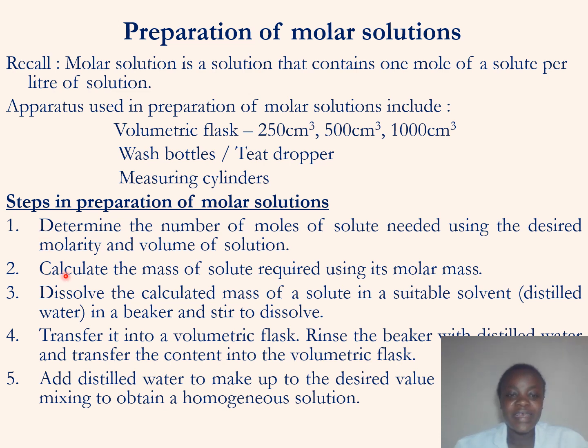The first step is to determine the number of moles of the solute needed using the desired molarity and volume of the solution. In most cases we are given the molarity of the required solution and the volume, the amount of solution we are going to prepare.